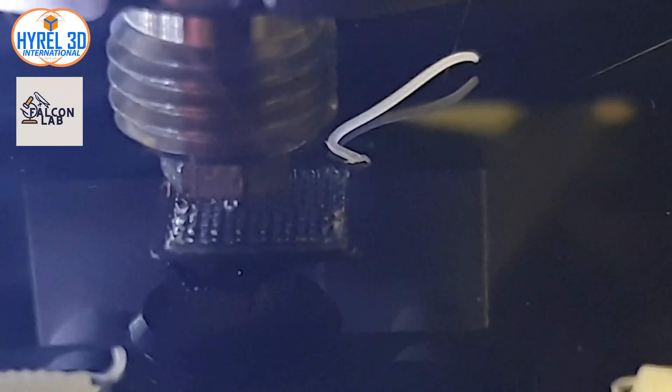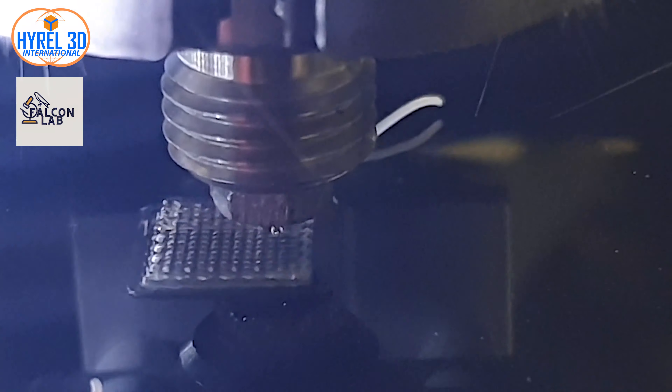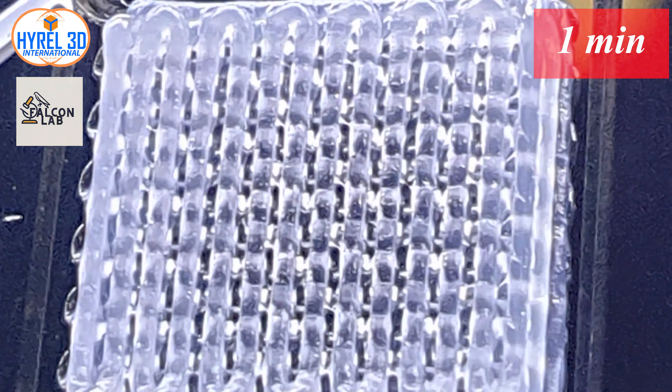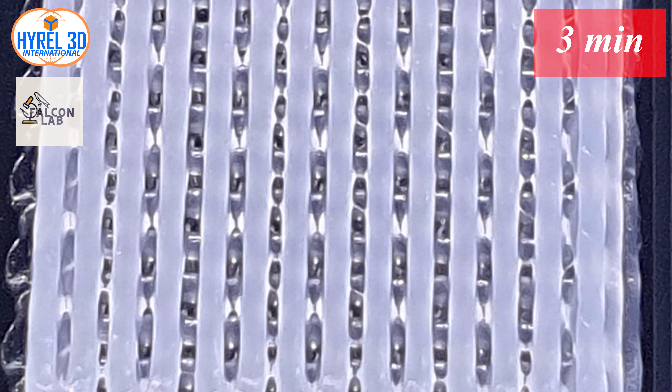Once you finish your print, you can notice that the printed object is transparent. We will leave the printed object for one minute to cool down, and you can notice it will start having a whitish color on the sides. In the second minute, you will see the sides of the scaffold becoming white more clearly.